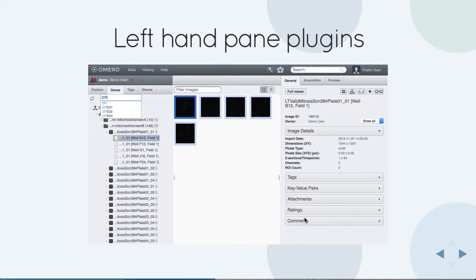This is something which is experimental at this moment. We are trying to make a left hand side panel more customized and take advantage of the existing data tree. At the moment this is a proposal for a custom map annotation application that allows us to browse data through map annotation values.